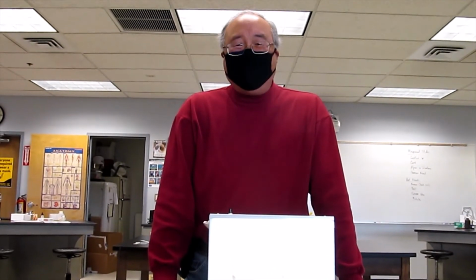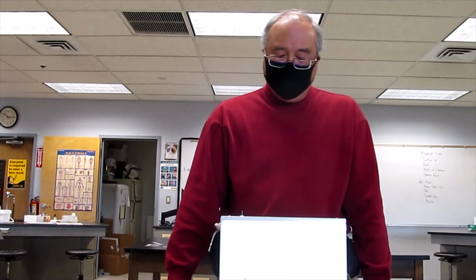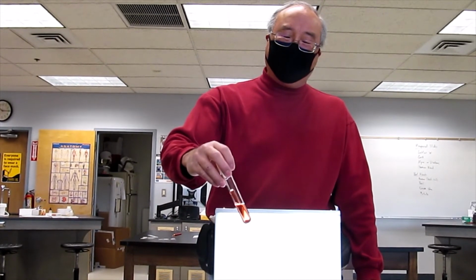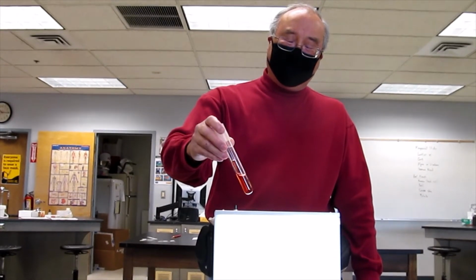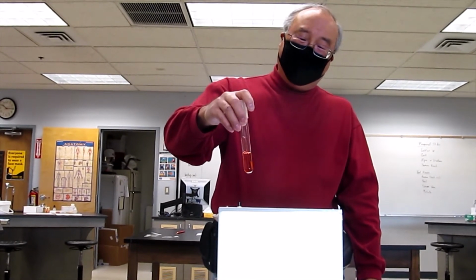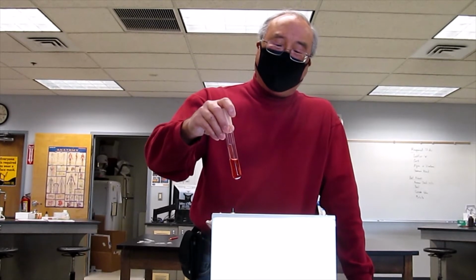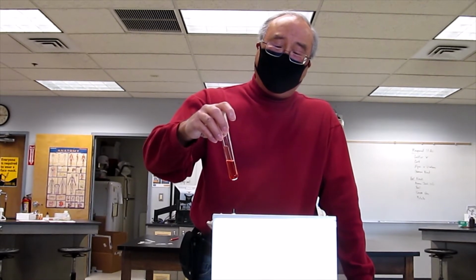We're going to talk about what sort of phenotype information you can get from a lactose fermentation tube here. So this is the starting culture that you would inoculate with your bacteria of choice. You should notice there's an upside down glass tube in the middle. That's called a Durham tube. And its purpose is to collect any gas that may be formed during metabolism of the media in this case.